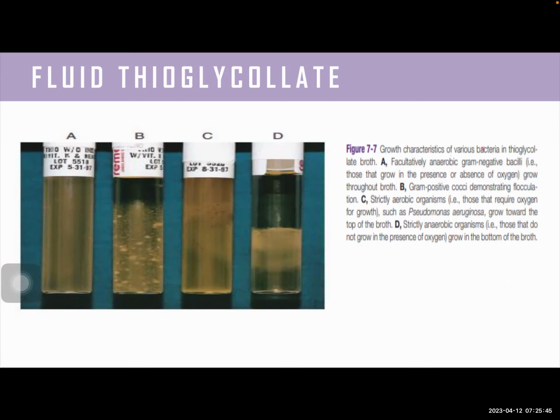Not because clear sa paningin mo yung broth, that doesn't 100% ensure us na wala ng bacteria doon. Kasi merong specific amount lang ng bacteria na yun lang yung point na kayang makita ng eyes natin. Or there is only a very specific amount of bacteria that will provide a very observable turbidity. Okay? Hope you get it by now.